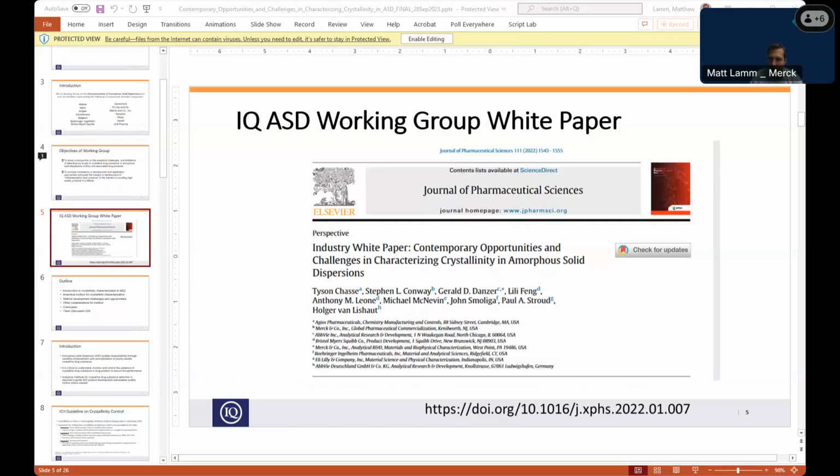I think it really depends on your amorphous solid dispersion system. If you have a system that is very unlikely to ever nucleate and grow, I think a limit approach is very acceptable. However, when you have a formulation that might be more susceptible to nucleate and grow in the drug product, then I think quantitation, at least in the development area, would be recommended so that you can follow and understand how much crystalline growth you might see during stability or stress stability studies.